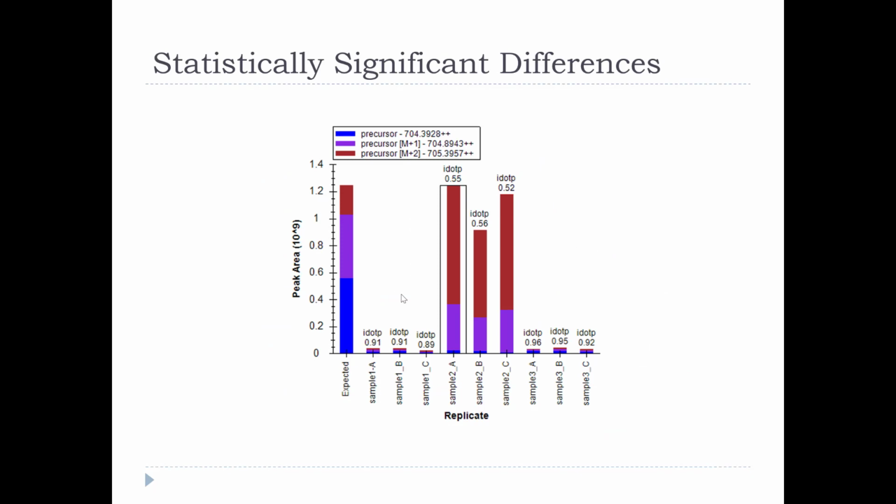Now by the end of this course, we're really going to be focused on statistical differences. Right? And is something statistically significant? So if I for a moment just blind you to the colors and the extra information on this plot, who thinks that the difference between sample 1 and 2 and sample 3 and 2 is statistically significant? So, only one person. Yeah? So why wouldn't it be statistically significant?